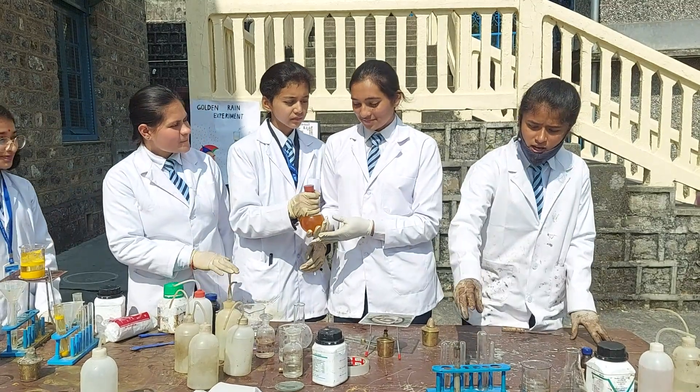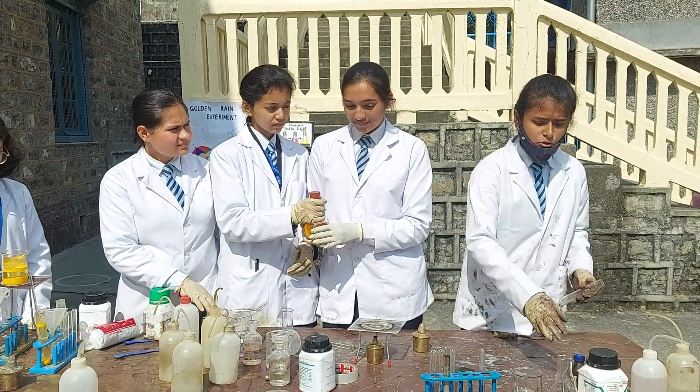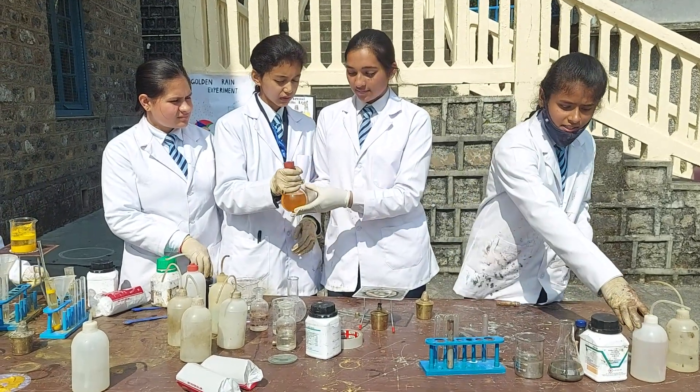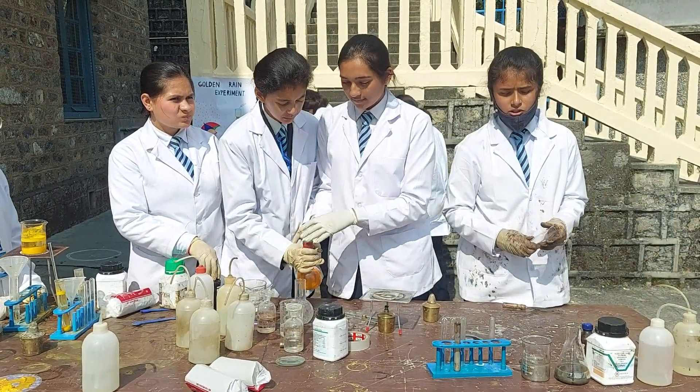We have a silver mirror experiment. In this we have to take a test tube, adding two scoops of anhydrous glucose, and then further adding distilled water to it, making a solution.